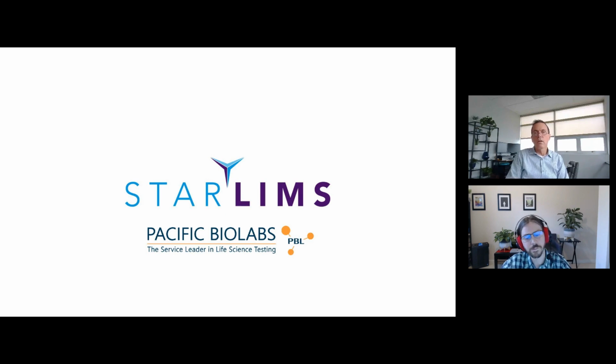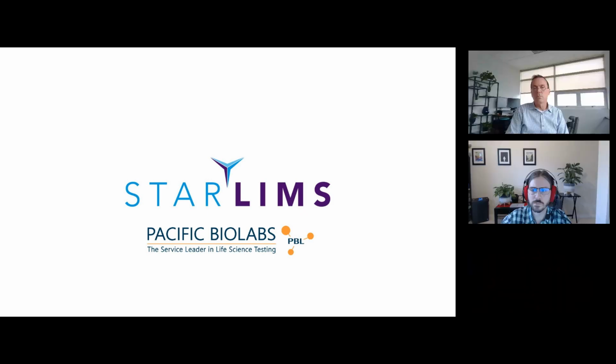Okay, great. Thanks very much. We're going to skip around a bit. There should be another question with a little red circle next to it. Are there any standards for software validation?